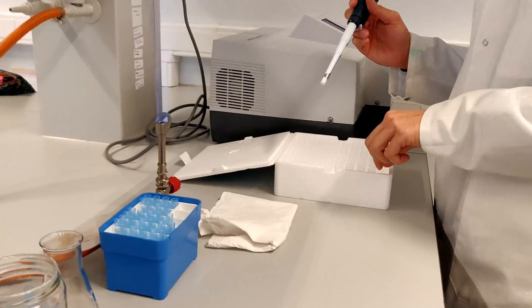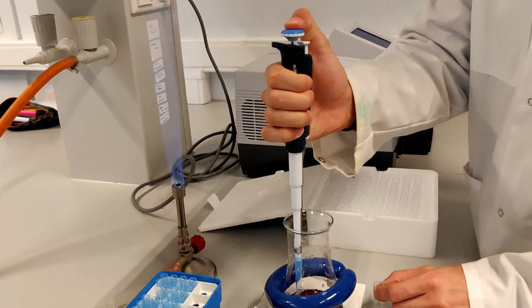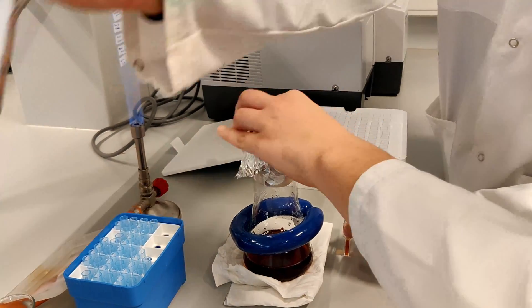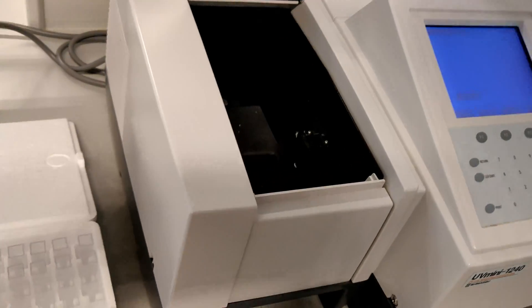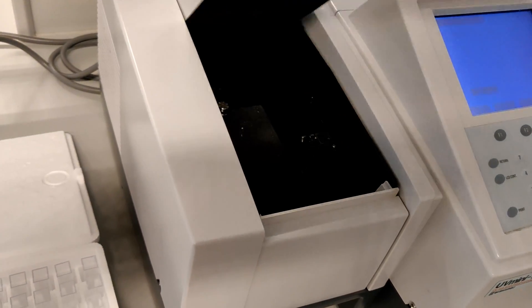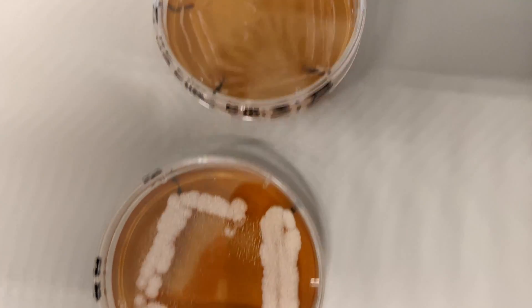Next we also determined the generation time from the colonies of interest, which is the time a culture needs to double its cells. You can measure the growth of a culture indirectly by incubating it in a warm water bath at 30 degrees Celsius and measuring the optical density of the culture solution with a spectrophotometer every 15 minutes for a couple of hours. When time passes, more cells grow, the cell solution will become more cloudy and the measured OD, the optical density, will increase. You obtain a graph and can calculate the generation time with a formula to get additional information about your colony.